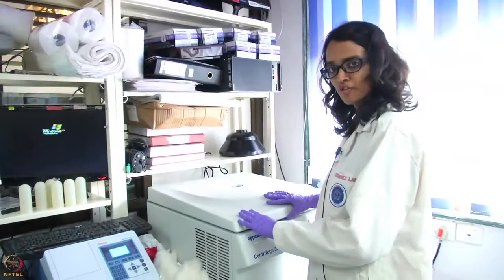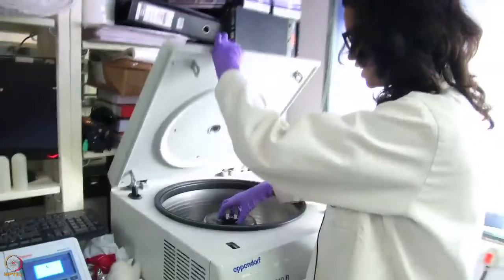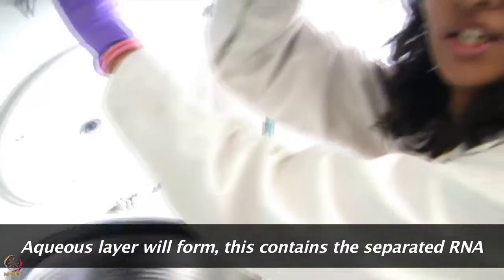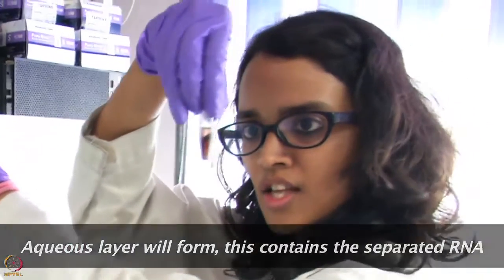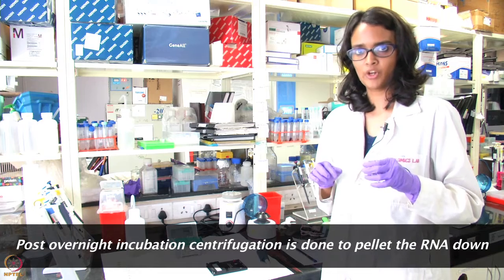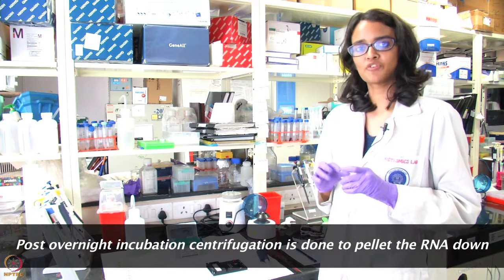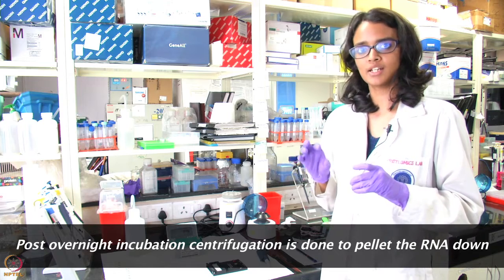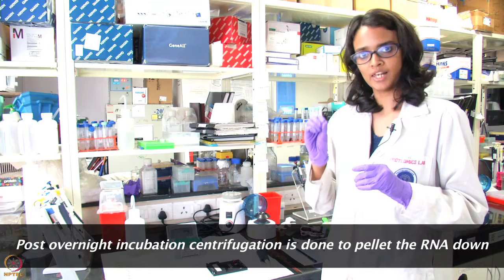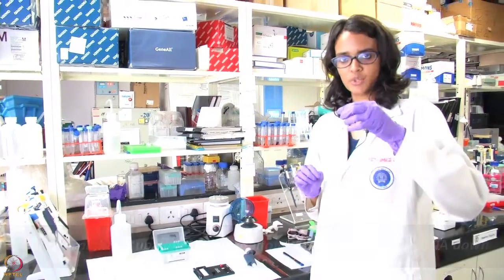After addition of chloroform and centrifuging the tubes, we will now see that an aqueous layer has formed, as you can see. After incubating the samples overnight in isopropanol, the samples were centrifuged at high speed. Centrifugation at high speed results in the pelleting down of the extracted RNA. The pellet is then dissolved in sterile distilled water.